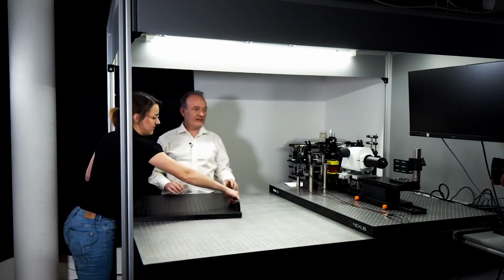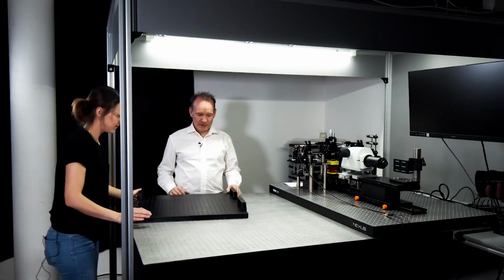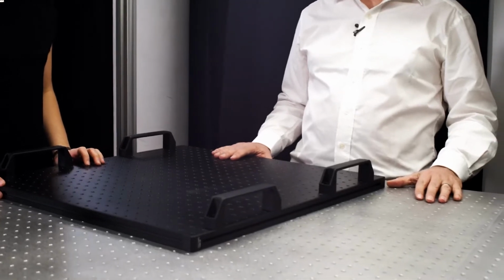We build it up. Probably we're not going to talk too much while we build it up. First, we need to do some screwing. Later on, some cabling to get the mouse and the keyboard and the monitor attached to the microscope controller. But after that, it's done maybe in 5 or 10 minutes. And after that, you're all set and ready to image. So let's get going.